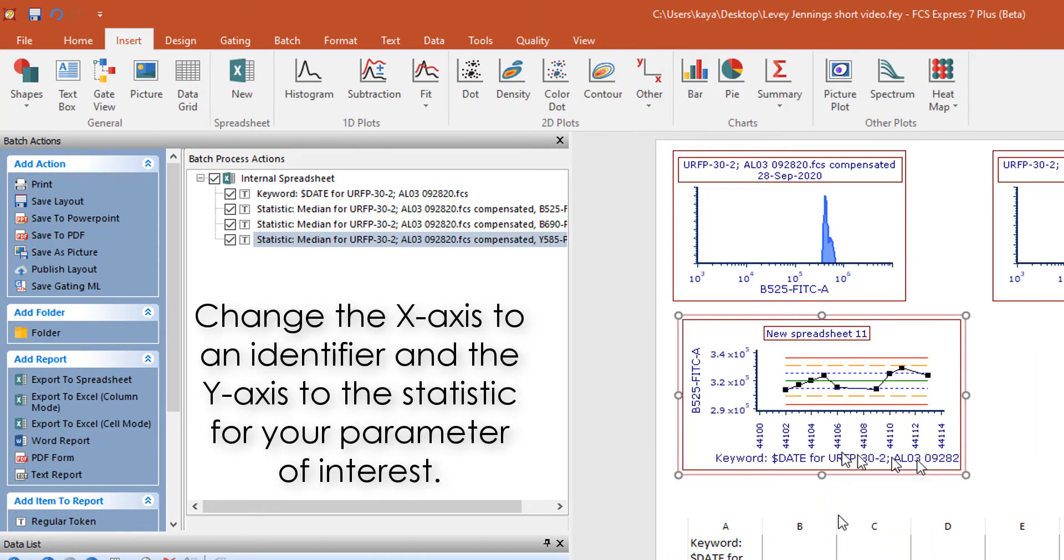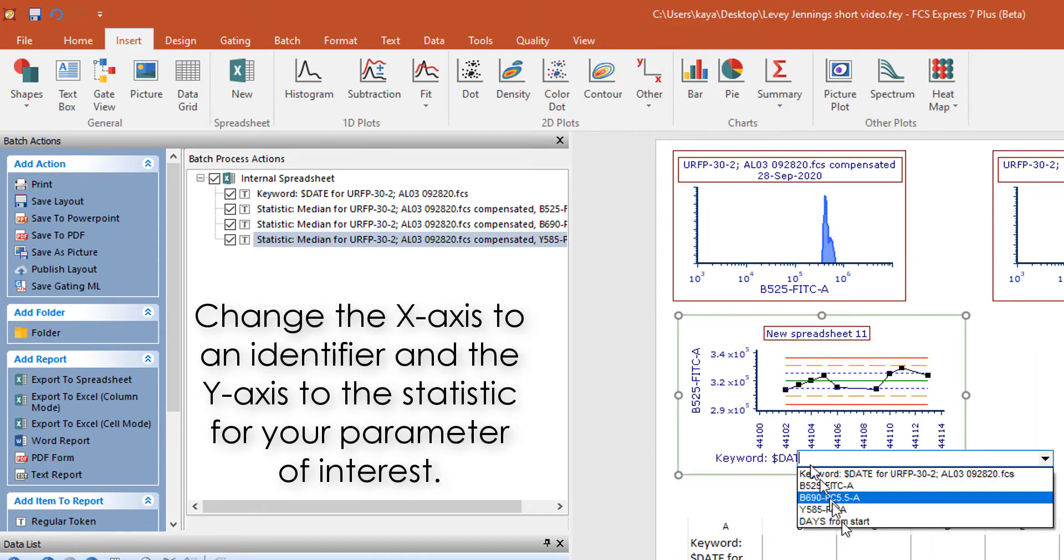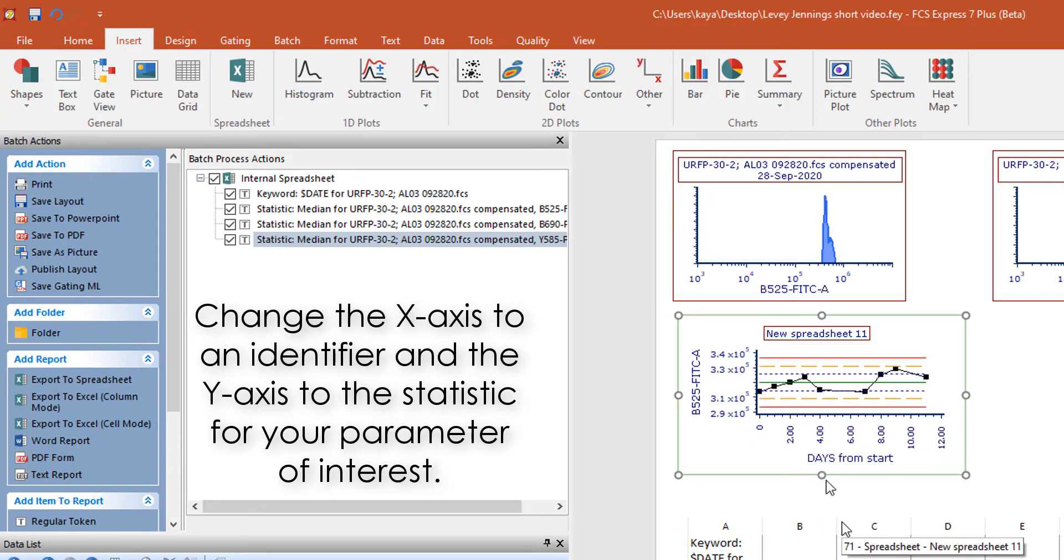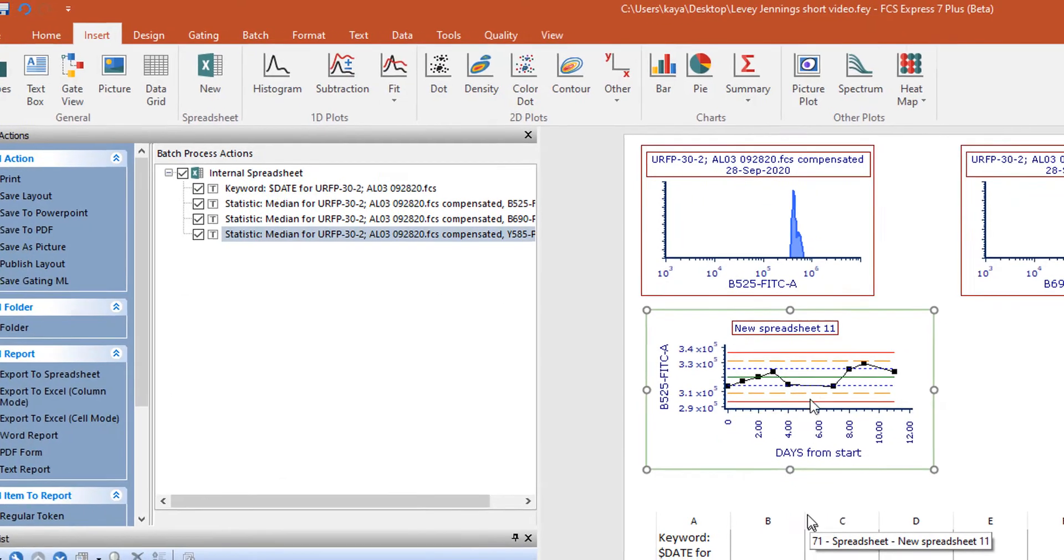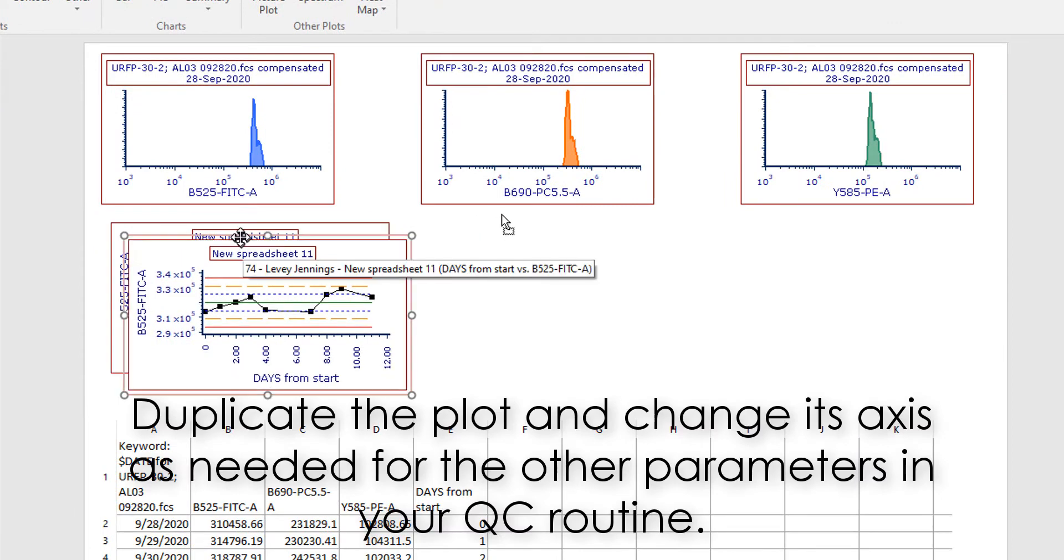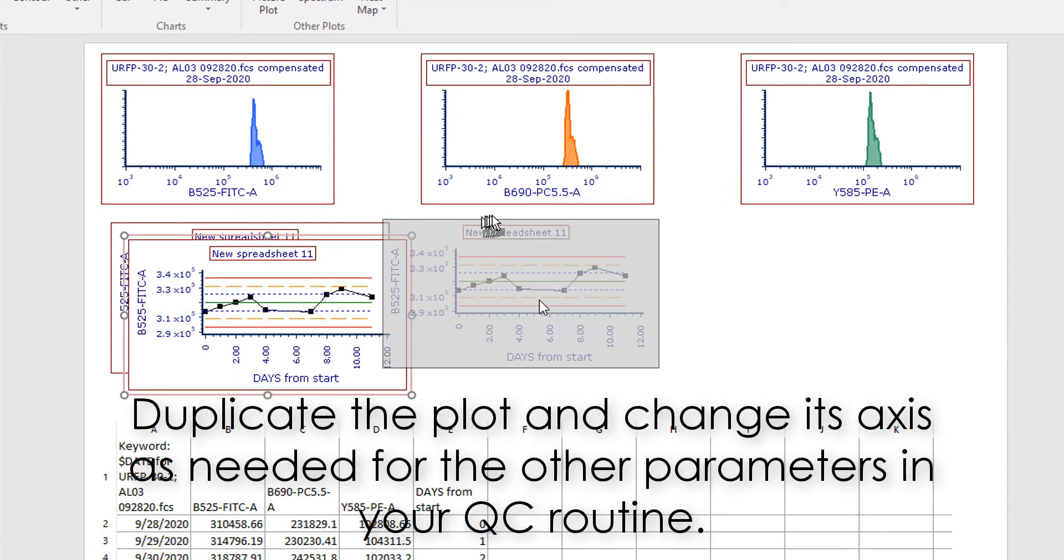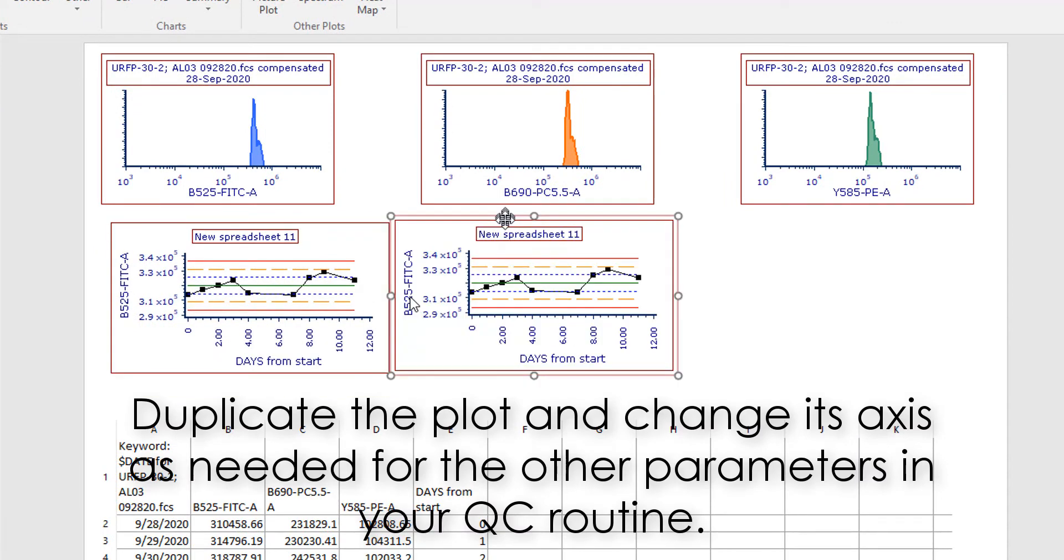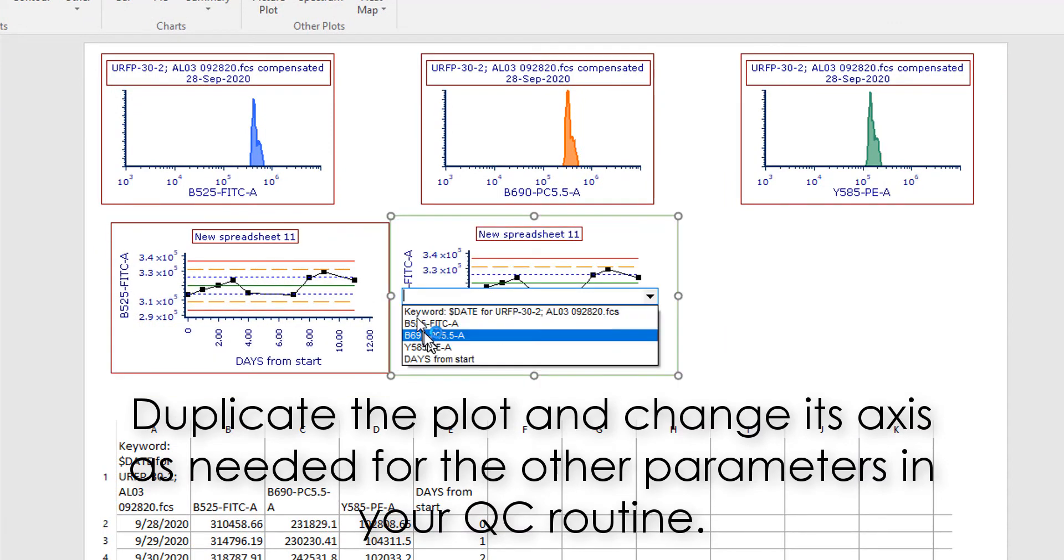Change the x-axis to days from start and the y-axis to the fluorescence parameter of interest. You can duplicate the plot for the additional parameters and change their y-axis as needed.